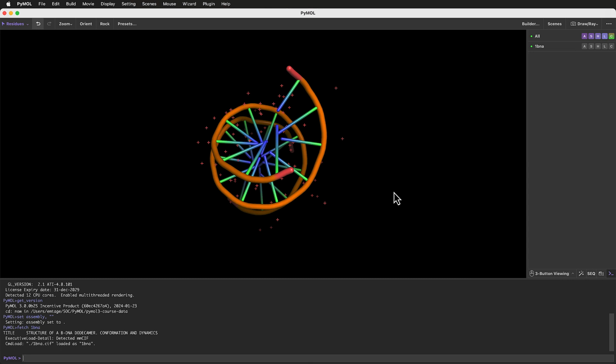On the right-hand side of the PyMOL interface, we can see that our PDB has been added to the Contents panel. The objects that PyMOL renders in 3D are loaded from coordinate files that describe locations of individual atoms in the molecule. PyMOL can display a large number of objects at a time, and we can use the Contents panel to adjust viewing modes, colors, labels, and just about anything relating to objects.